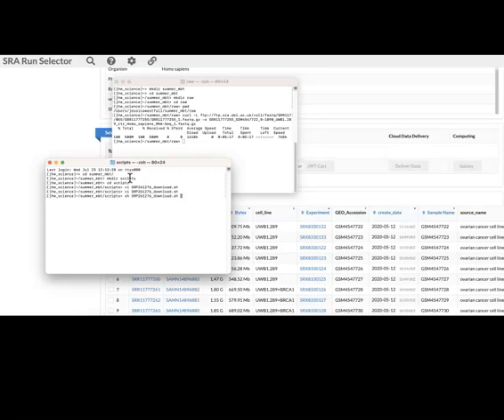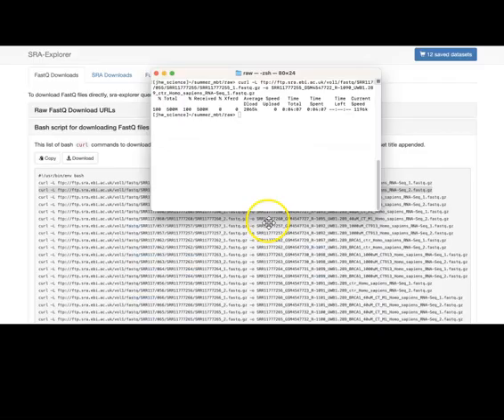You can download it to the script folder and then afterward move it from the script folder into your raw directory folder, or you can add an additional line that tells the shell script where your raw folder is on your local machine, and then tell it to download the output file to that folder itself. But the focus right now is to show you how to go about downloading the SRA file in general, so I won't go too much into shell scripting at this point.